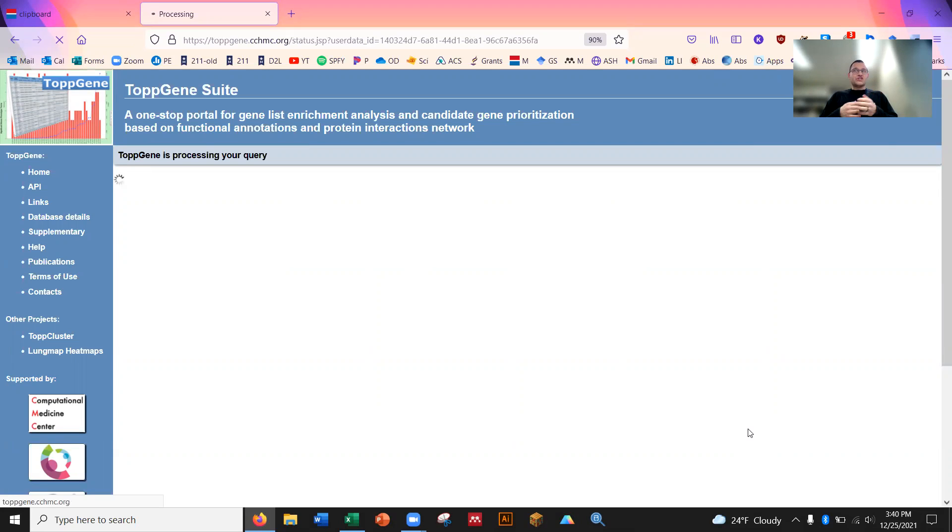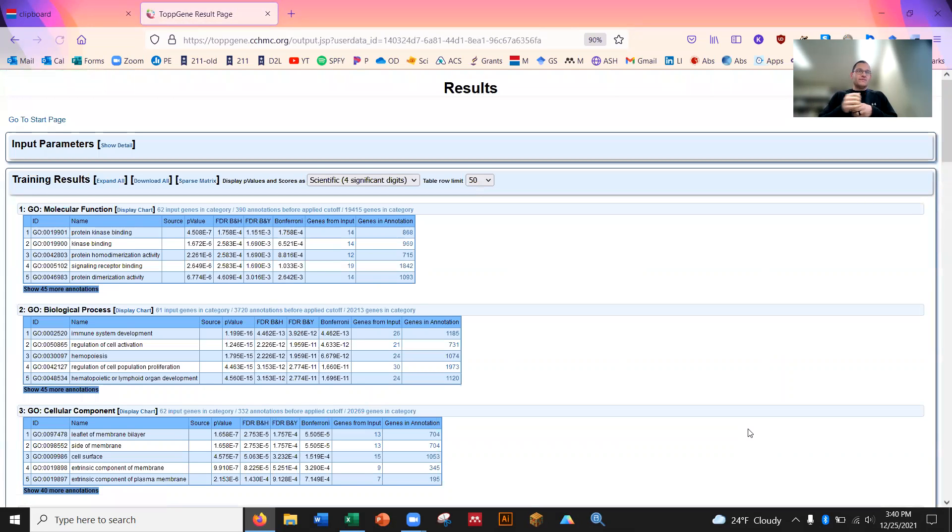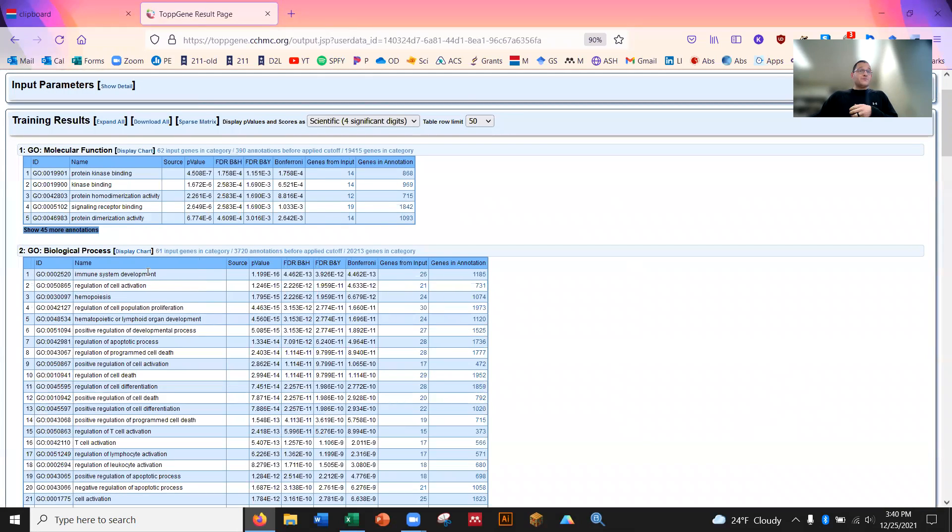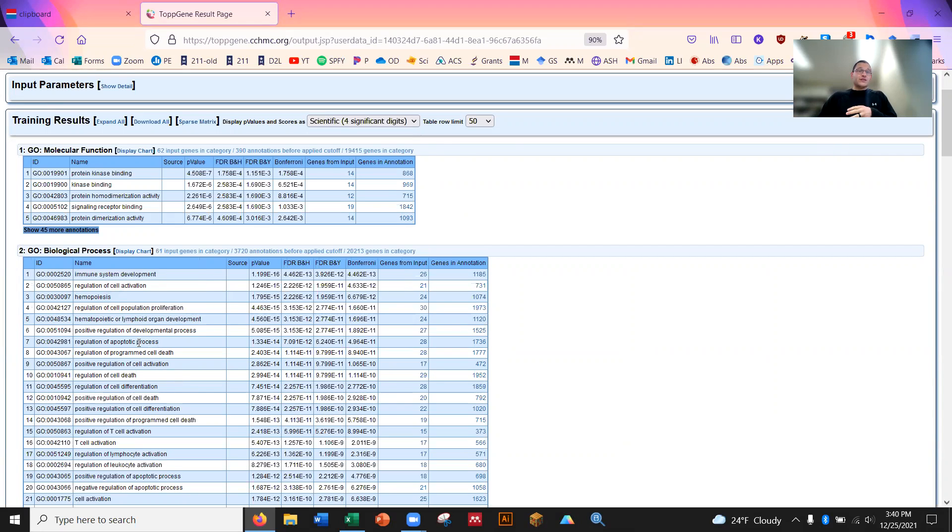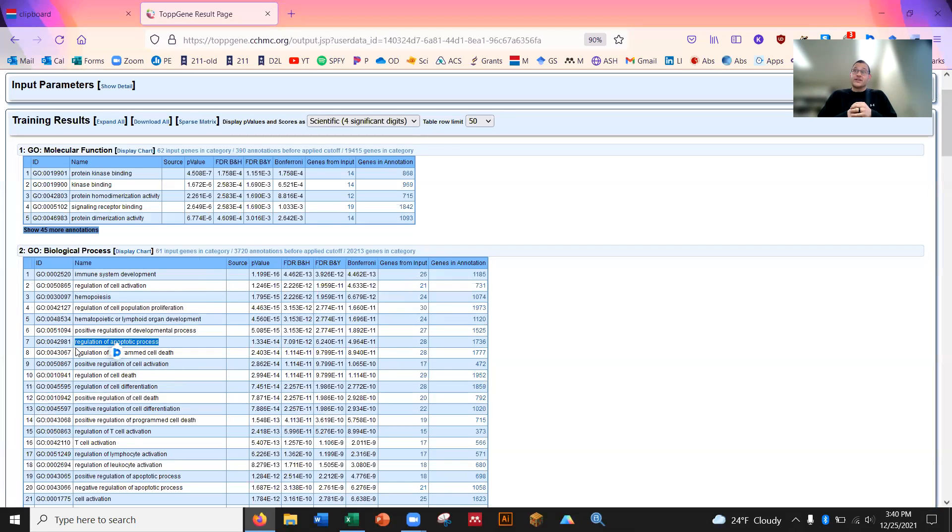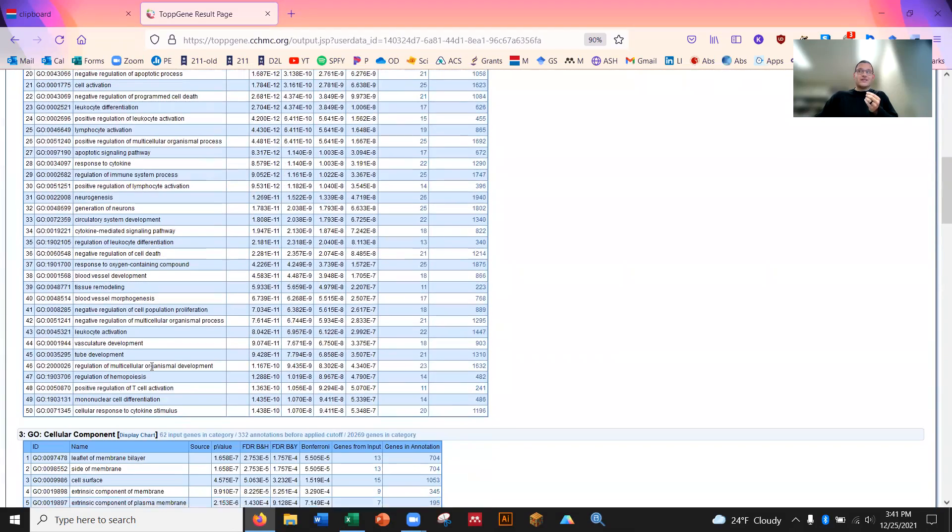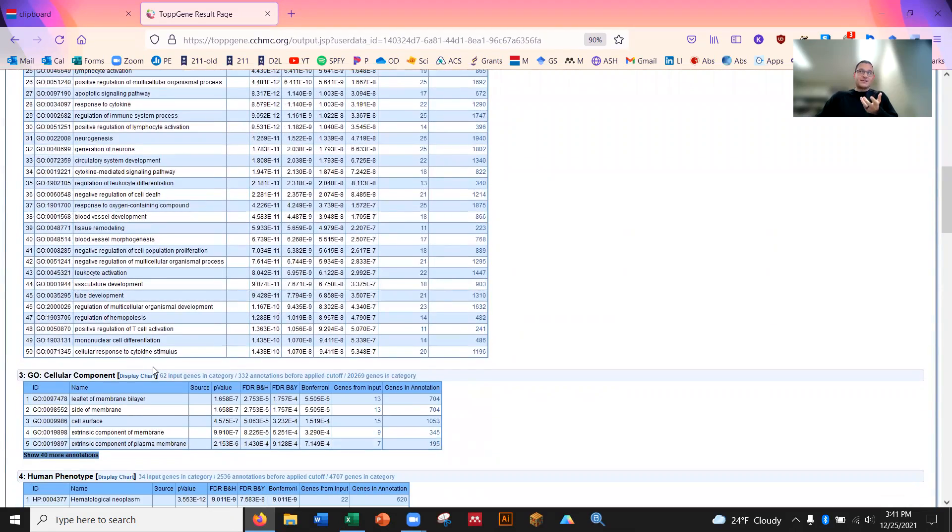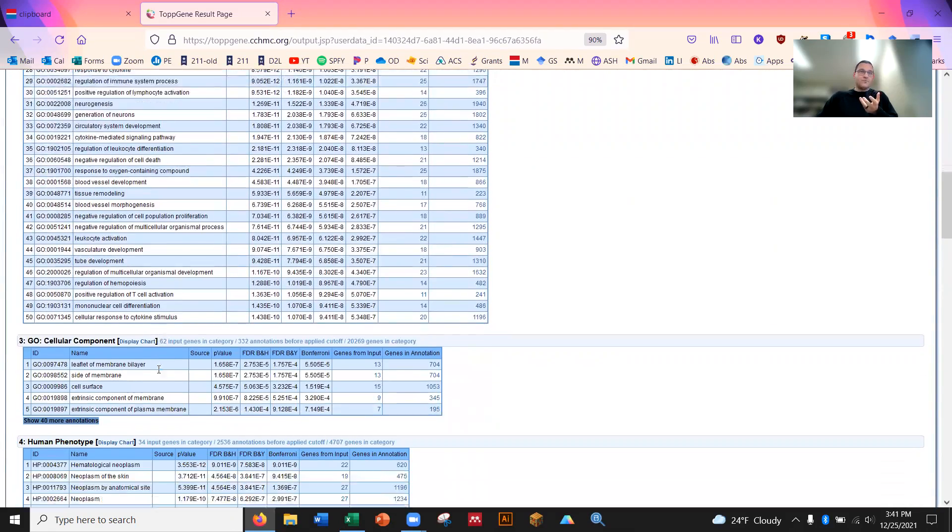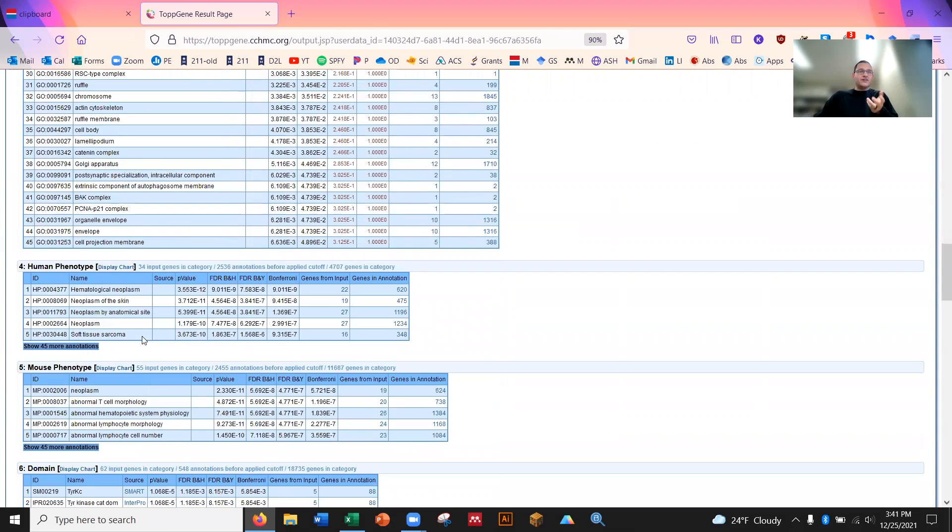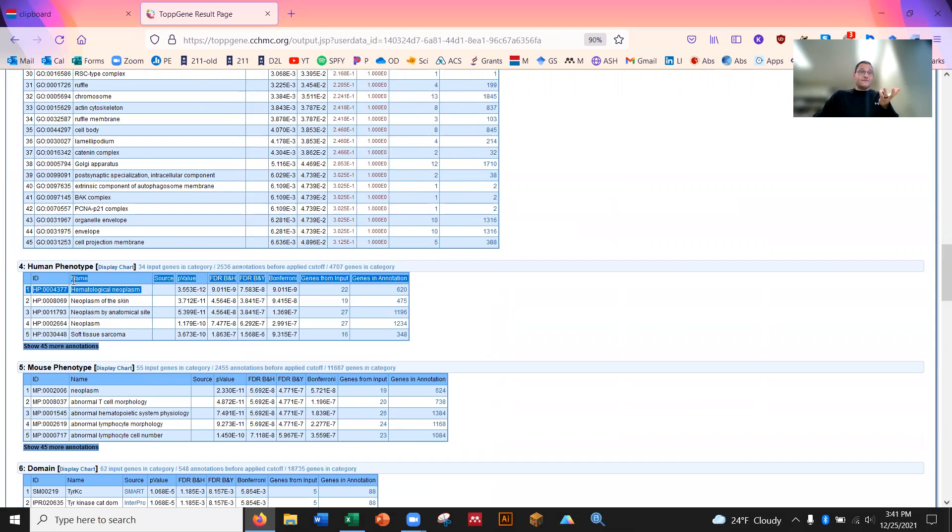So all these genes that we got in here, I'm a lymphoma person. I don't know every single one of these genes. There's 62 of them. I know some of these characters, sure. What this tool does, and it's very easy to do, is it takes groups of genes and it tells me with statistical significance, what are these genes involved in? So we just lost P53 in these patients. What exactly is kind of going on in their tumors? Right here, you can see a lot of stuff here. It's a big one right here. When you lose P53, you lose a lot of immune signaling. You lose a lot of the ability to do apoptosis for a cell to die. To lose the ability to die and survive indefinitely, that's exactly what a cancer cell wants.